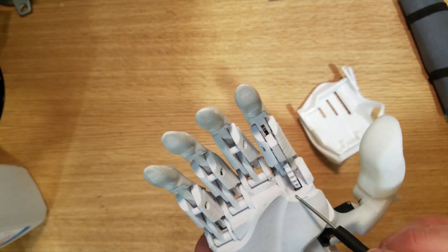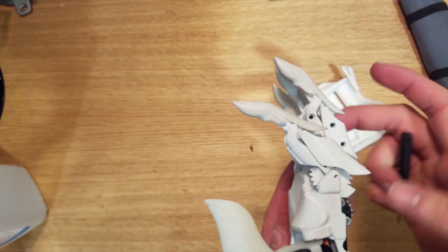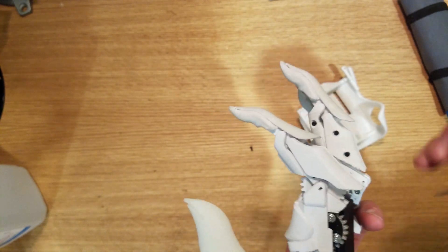Eventually we will have this plastic gear replaced by aluminum, so that both of the gears in the index finger are going to be aluminum.